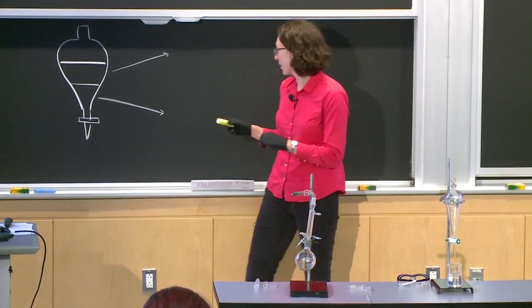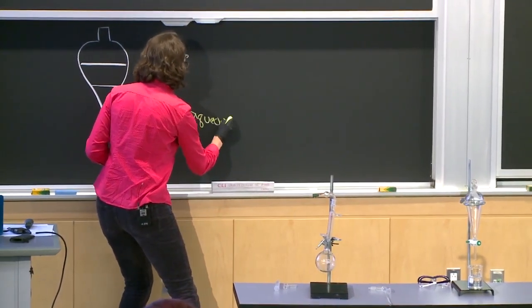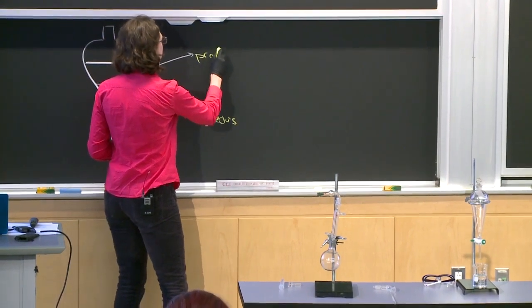Water will be on the bottom. Yep, so this will be our aqueous layer. And this will be our product or our organic layer.